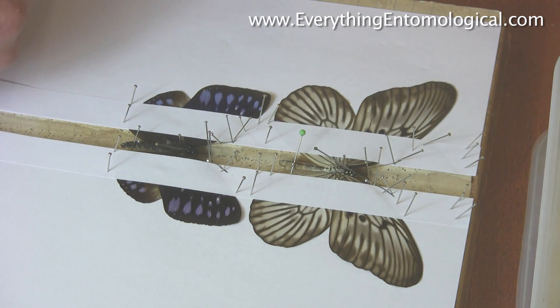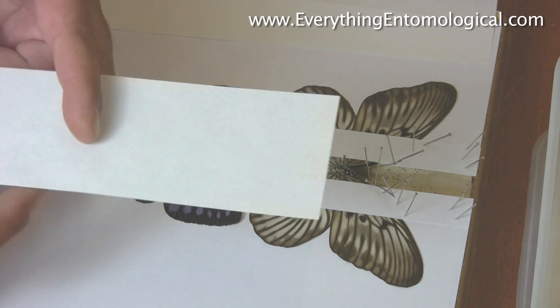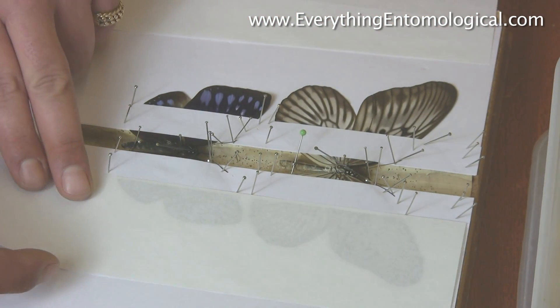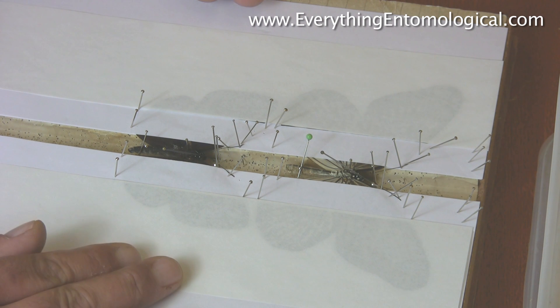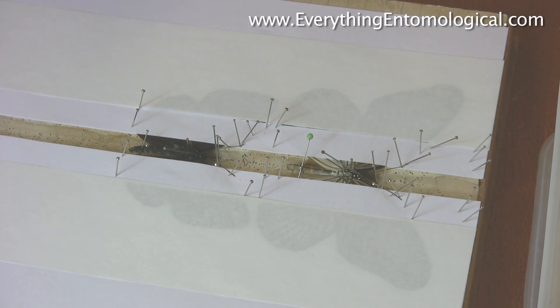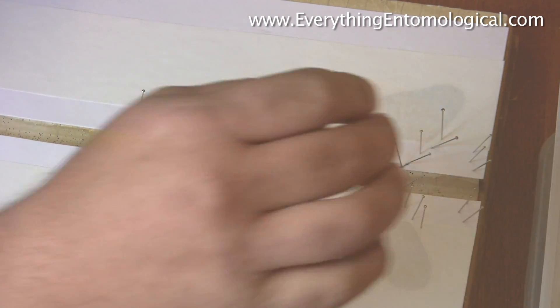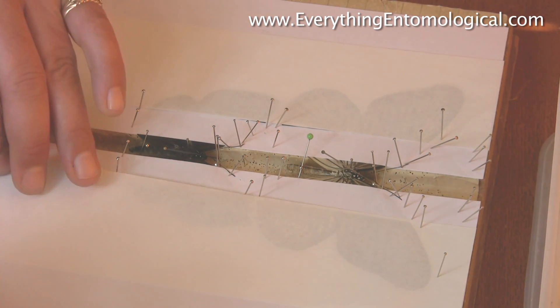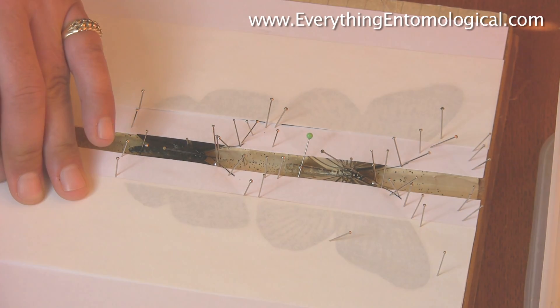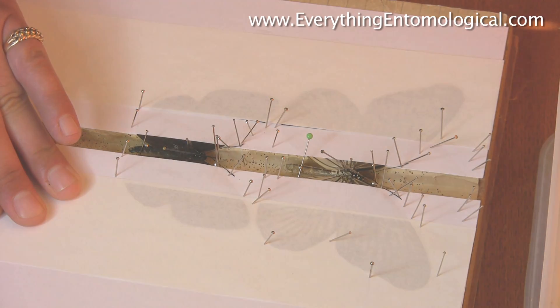To keep the specimen flat, what I use is a slightly thinner paper — thinner than your A4 — and you can see through it. You drop this on there on both sides so you completely cover your specimen, which keeps any dust off the wings. Then you pin it: once you've got it like this, pull tight to a degree and put in pins — not through the wings but at the side of the wings — keeping it nice and tight, which keeps the butterflies nice and flat.